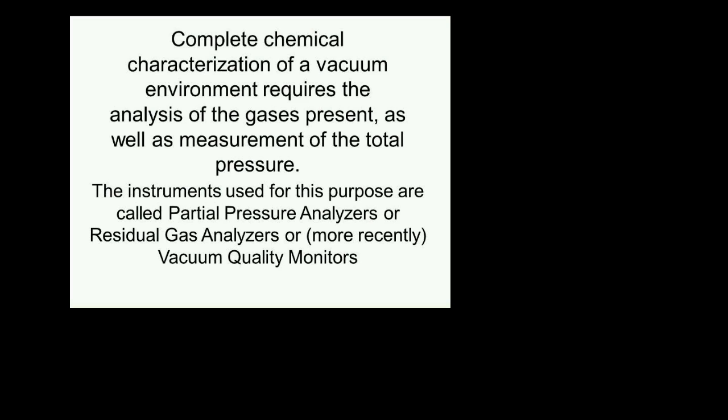There is another type of residual gas analyzer called a vacuum quality monitor, which is based on ion trap technology. We do not have time today to cover that. If you are interested in that sort of technology, what I recommend is that you look for the full short course that we teach at the AVS, typically in symposia, local or international. And there I will also cover the ion trap vacuum quality monitors as well.